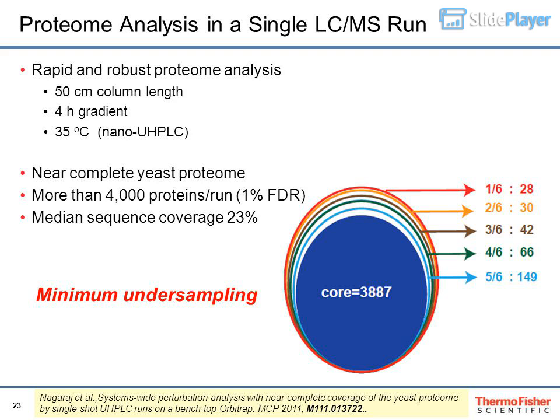50 cm column with 75 µm inner diameter, packed in-house with 1.8 µm C18 particles, Dr. Maisch GmbH, Germany. To facilitate deep sampling of the proteome, we employed relatively long columns and small particle sizes, 50 cm, 1.8 µm. This was readily accommodated by the UPLC pump, which produced a stable flow of 250 nl per minute at 500 bar. Another advantage of the UPLC system is its ability to load sample at a higher flow rate and to equilibrate columns more quickly, leading to a shortening of overhead times.